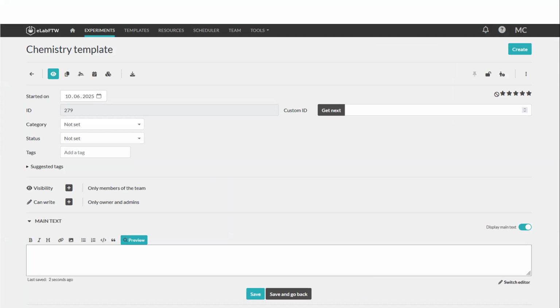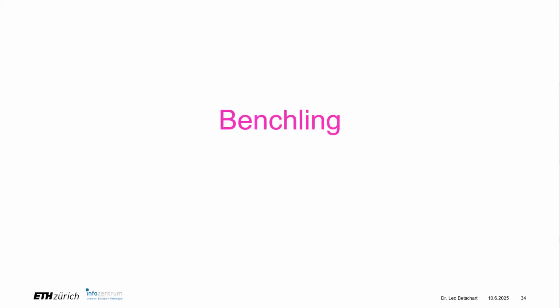So maybe if you work in an area of chemistry where structural formulas are not that key to your everyday workflow, then this might be something for you. Also because it is open source and it has various other plugins. For example, it also has a scheduler functionality. So if that's an issue that ails you within your group, that you have certain devices that are very popular and you sort of need to allocate the time, many of these ELNs also offer work tools like that.